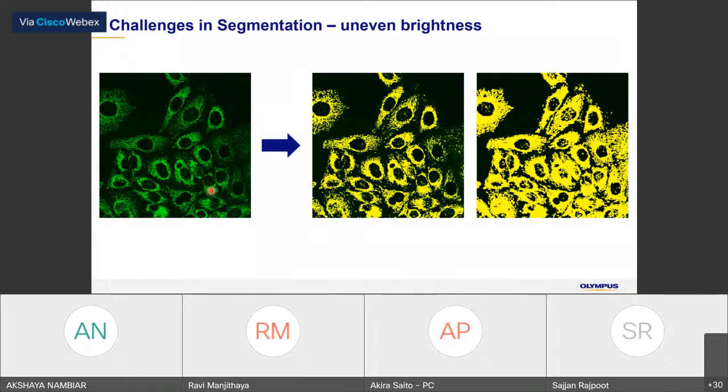For example, this image is a mitochondria stained image with fluorescence. You can see that this is the fluorescence image, and we use intensity thresholding. Say you found a good threshold, but in this area it looks like some of the mitochondria are not detected.